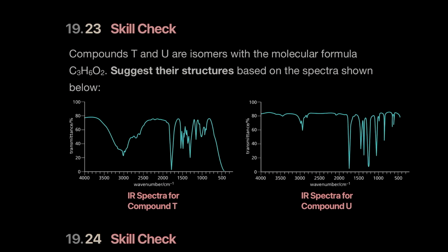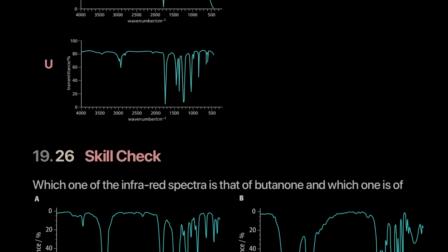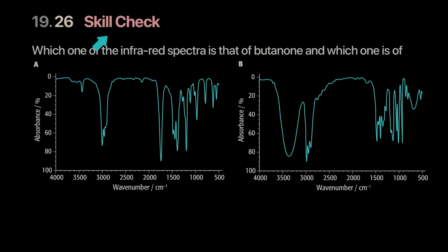Let me show you something else similar to this. Look at these two fellows. This has a very wide valley. So by looking at this graph, I can right away say, hey, this must be a carboxylic acid. Let me show you some more examples. In this case, none of them have that wide trough. This is two peaks, it's not one. So we know this is not an acid, this is not an acid.